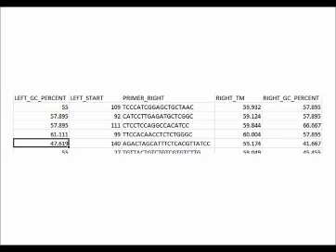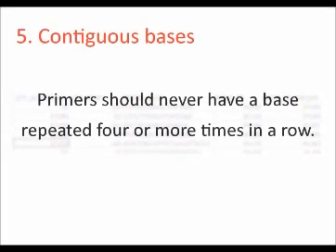Okay, so on to number 5. Of course, if you're struggling to keep up here, remember you can pause and rewind and go back and watch it again. But we'll move on right now to number 5, which is called contiguous bases.